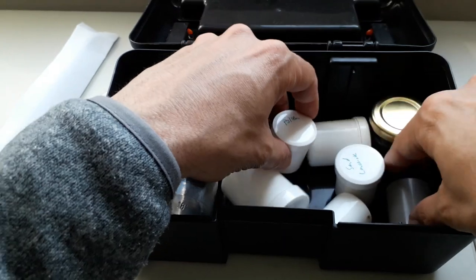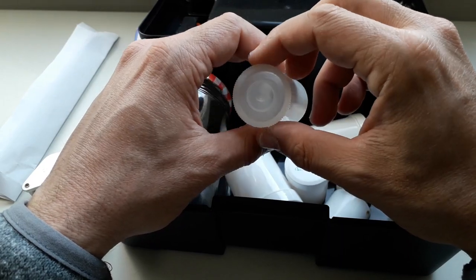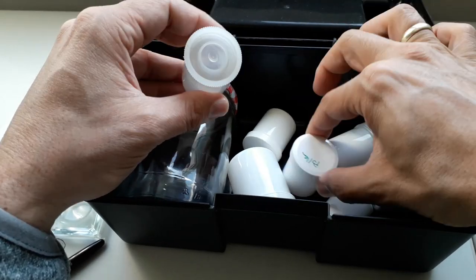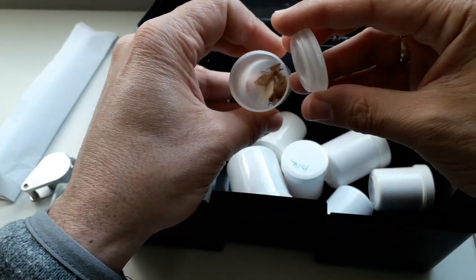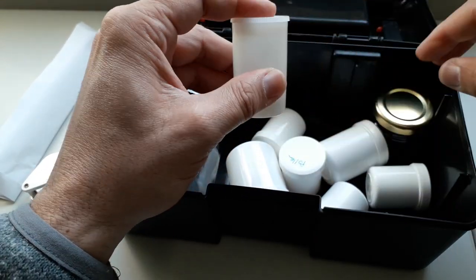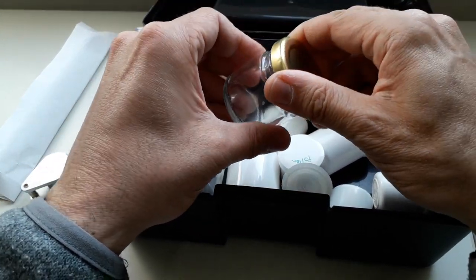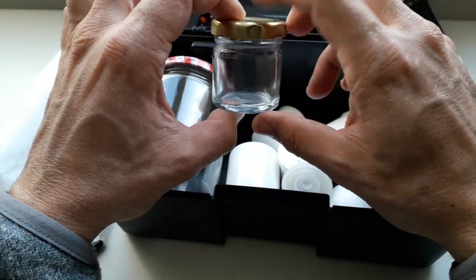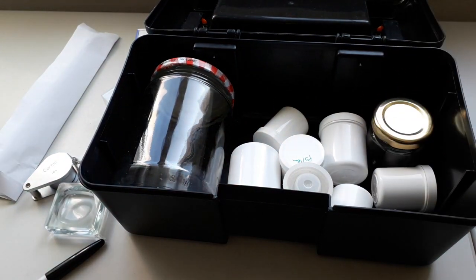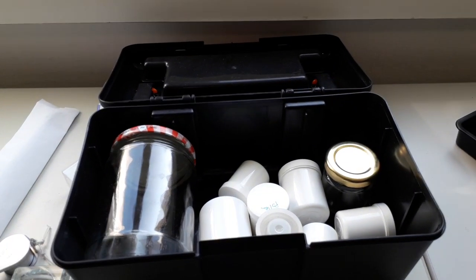If you don't have these, over eBay you can also buy those old plastic film canisters. Usually they are also quite low cost, and they are also watertight. Before I switched over to these here, I used those film canisters. I don't even remember what's in here. Some fish scales and some plant material. I mixed them. Okay. Also very useful for smaller water samples are those small glass jars, especially for algae. They allow light to go through, and therefore I use them also for water samples. And what I sometimes do is I simply put the jar as it is on my windowsill, and then they get enough light.